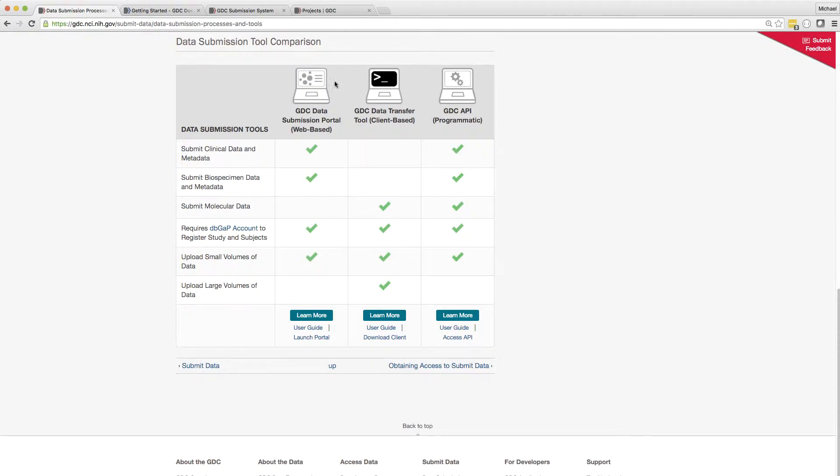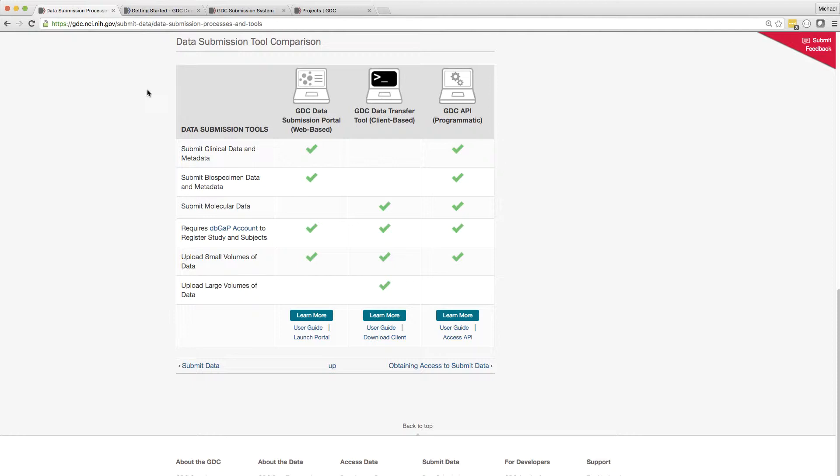This tool can work with both TCP and UDP transport protocols and can resume interrupted file transfers. Advanced options, such as specifying the chunk size or number of threads, are also available.